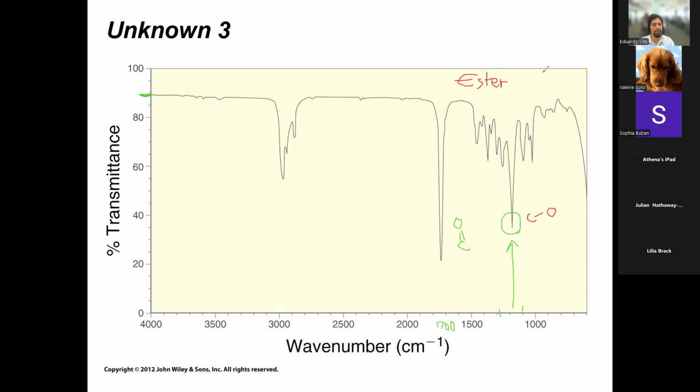And then also, I want to bring your attention to this, right? This is a subtle detail. I noticed that there's two peaks right here, these two peaks. And there was one slide that we talked about earlier where this is a special case for a carbonyl, right? This is where knowing your carbonyl functional groups is really useful. These two peaks are below 3000 but above 2800. So between 2800 and 3000, if you suspect you have a carbonyl and you see peaks in this region, you might have an aldehyde specifically, which looks like this, right?